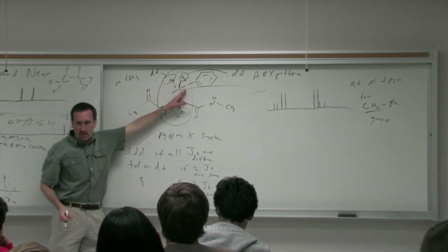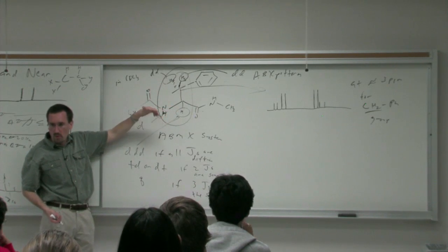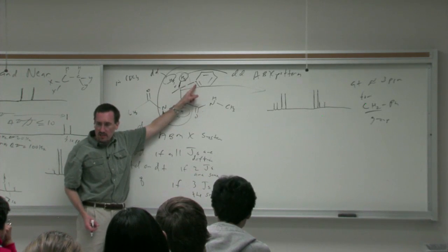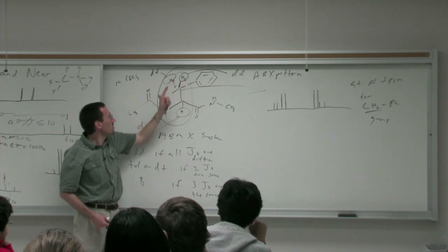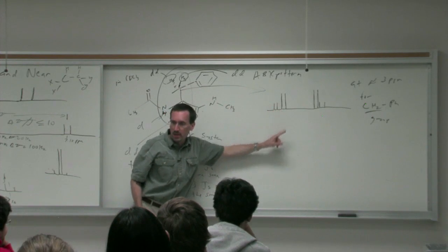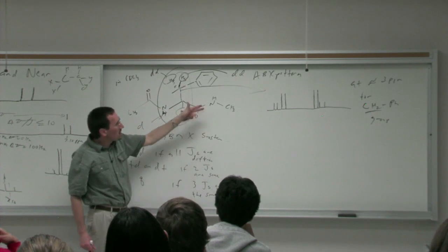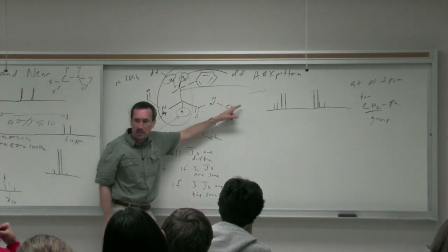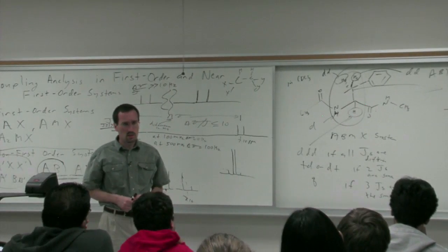If I knew the geometry here, for example, if I knew the phenyl group preferred to point in one way or another, or I could, by nuclear Overhauser effect experiments and the like, detect certain proximities, then I would be able to get an experimental correlation or predicted correlation based on, say, proximity to anisotropic groups of one proton and one peak. So right now, I don't know which is which. But with additional experiments, this is obviously just a sketch, but with additional experiments in context, yes, you can figure out which diastereotopic proton is which. Other thoughts and questions?